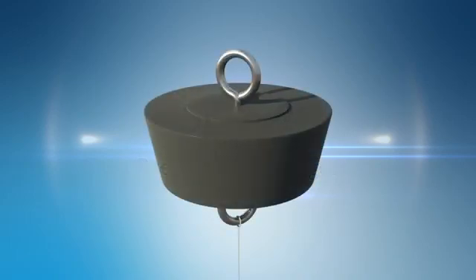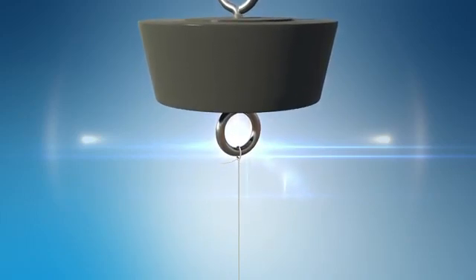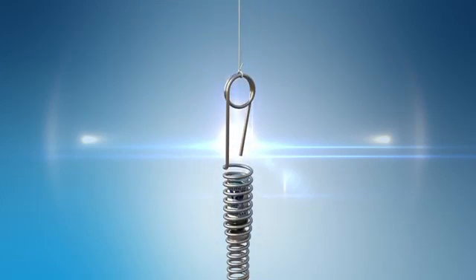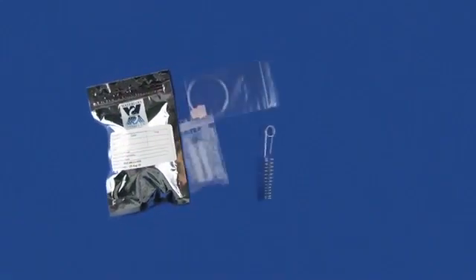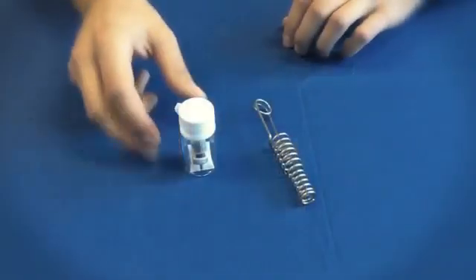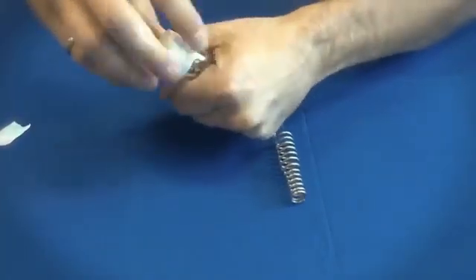Measure a length of the fishing line supplied with the sampler, adding a few inches to tie it at both ends. Tie the top end to the eye screw at the bottom of the rubber stopper, and tie the lower end to the loop on the wire hanger. The sampler is shipped in a protective ziplock aluminum package and glass vial, which protects the sampler from exposure to chemicals during shipping. Remove the sampler from the glass vial. Note that sampling has now begun.